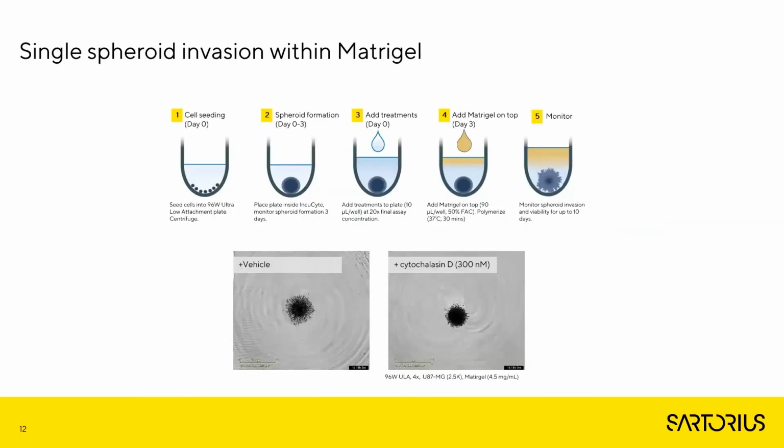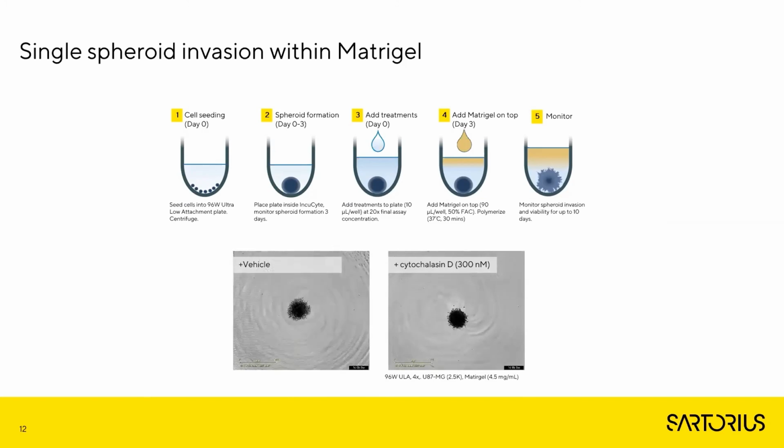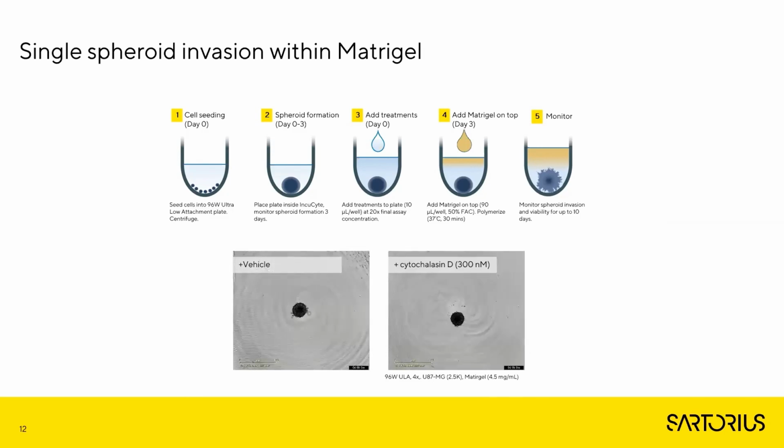So I'd now like to focus on another application, which is the study of solid tumor invasion. I already described earlier how cell invasion is considered a notable hallmark or phenotype of malignant cancers. And we know that the ability of tumor cells to form a metastatic or spreading tumor is largely determined by the cell's ability to reorganize its cellular morphology and degrade the extracellular matrix.